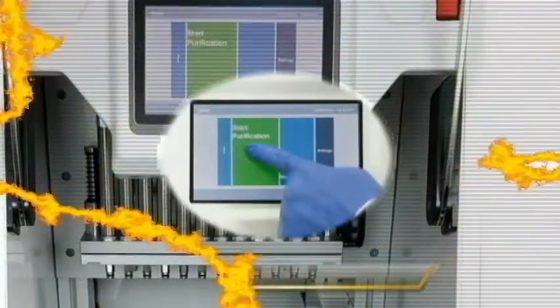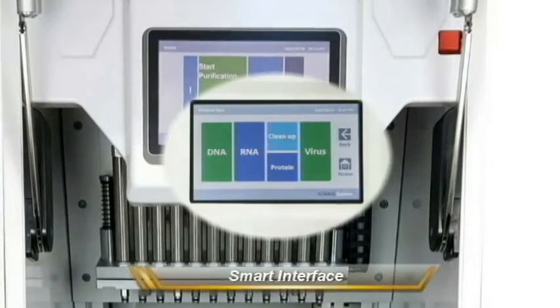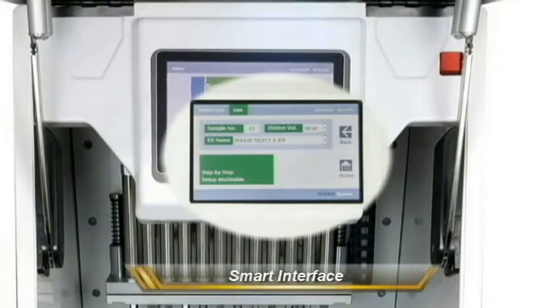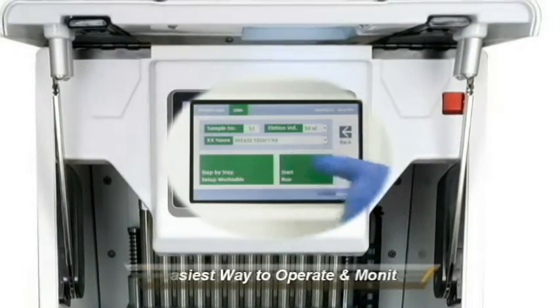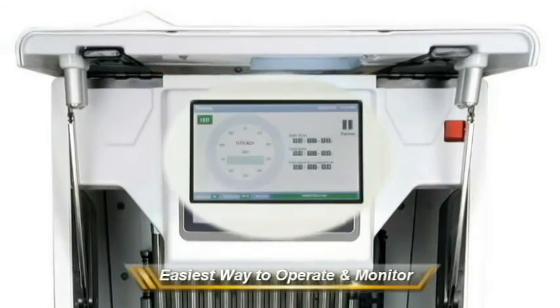With Steady's smart screen, operation is easier than 1, 2, 3. Select the target molecule, the genole kit type for the experiment, and just press start. The procedure can be monitored in real time.